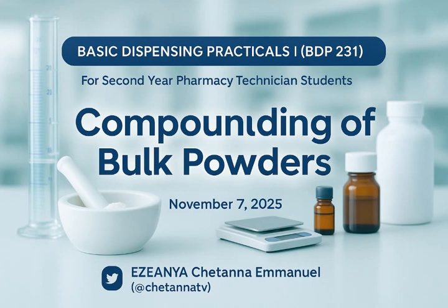Good. No matter how loss occurs, at least you can get 50 gram. So if you want to do this practical now, you weigh 20 gram of this, 20 gram of this, 40 gram of this. When you are done mixing totally, you may not get up to 80 gram again. From there, you weigh out 50 gram.